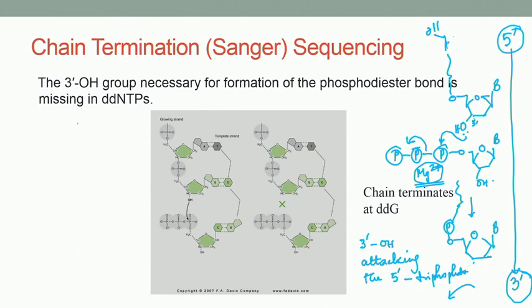So, during the growth, you have the template DNA strand and you have the primer up to this point suppose. So, the synthesis will not take place from here, because already I have said that the synthesis takes place from the 5 prime to the 3 prime direction.